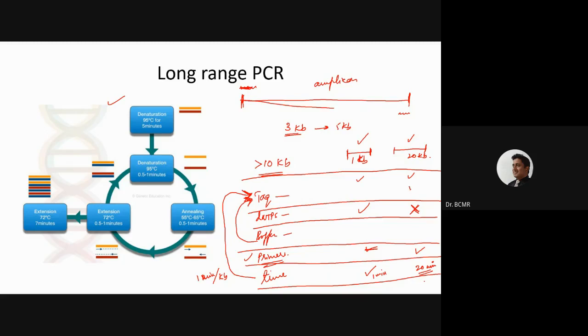So it is going to influence the enzyme in this reaction. So I will call this reaction A and this larger amplicon one reaction B. If we compare, we know what the problems are. The next problem will be about mutations.